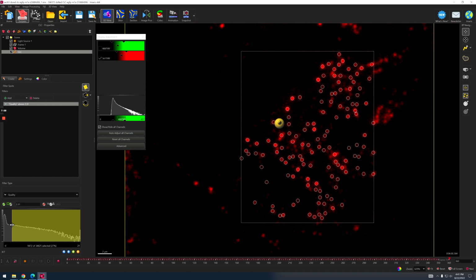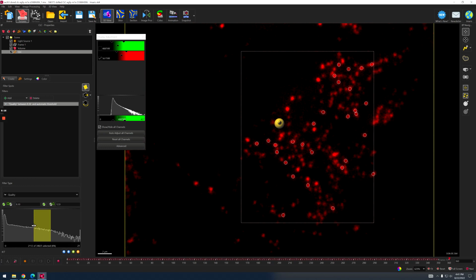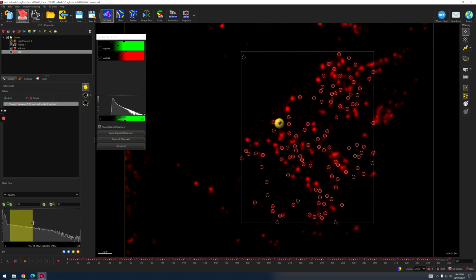I think for the lower part I would like to go a little lower. So here it's purely by eyeballing it and your adjustment. And then for the maximum, you can just set it here.